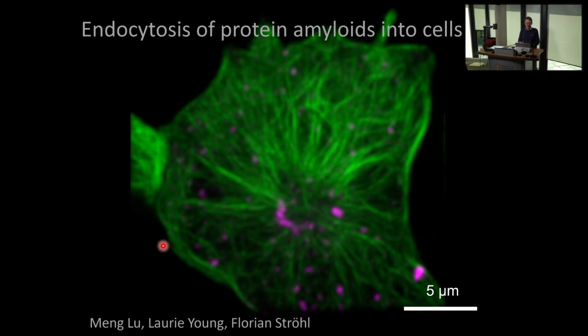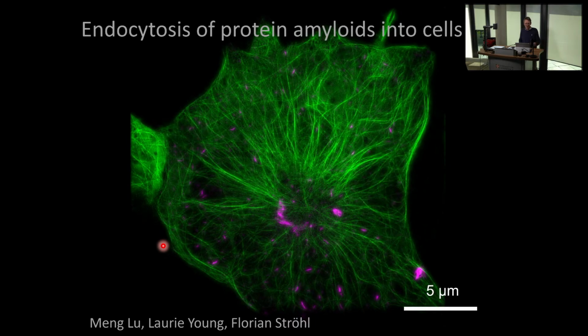But that's the sort of image you get on a normal high-quality fluorescence microscope. And SIM turns an image like that into this. And that is just with that factor 2 resolution increase, 2 along X, 2 along Y, and 2 along Z.